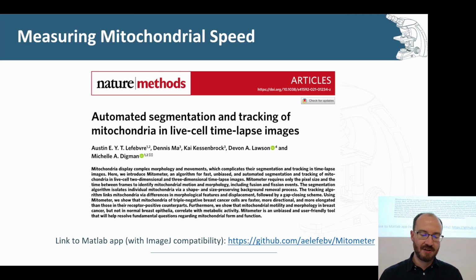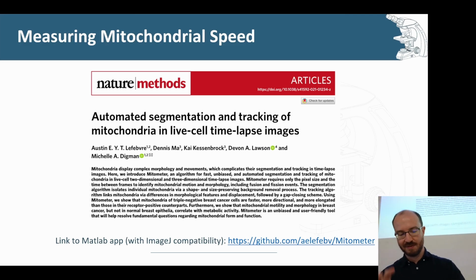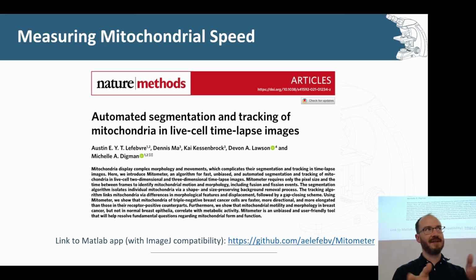they did something very similar to what I did. It's just that they focused more on the migration of mitochondria, and they tracked it in an interesting way, which I think you might understand most of by now. But they don't get the location as to where the events actually occur. So there's some space for that method of mine, which is called mitochondrial event localizer, or MEL for short.